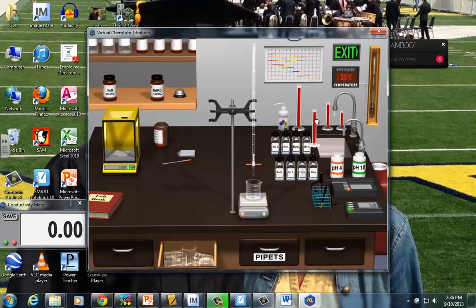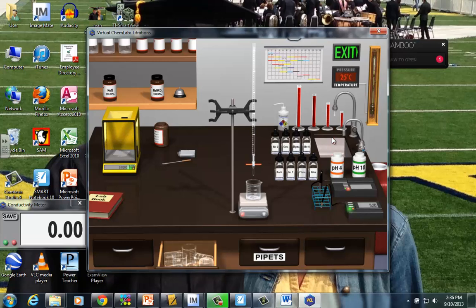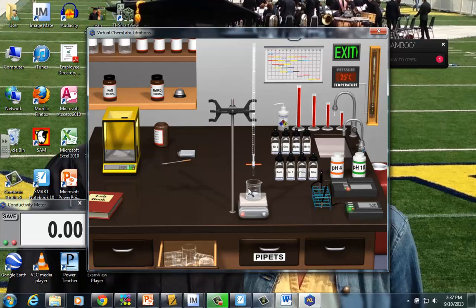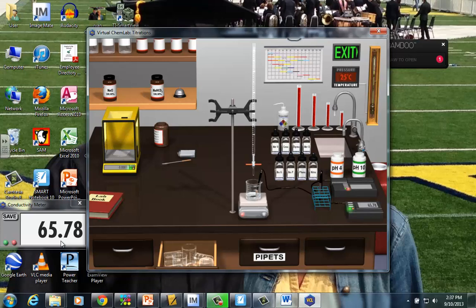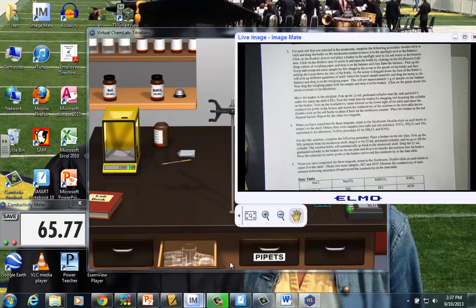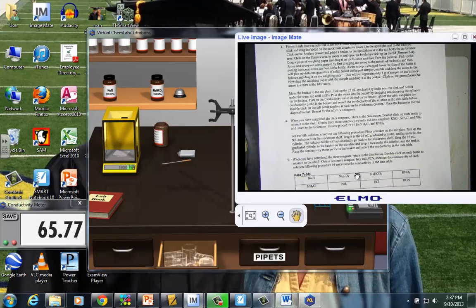I need to pour in 25 mils. So I'm going to put that under the faucet. Pour it in. And get it to stir up. I need the conductivity meter. And here's the value for sodium carbonate giving us 65.78.